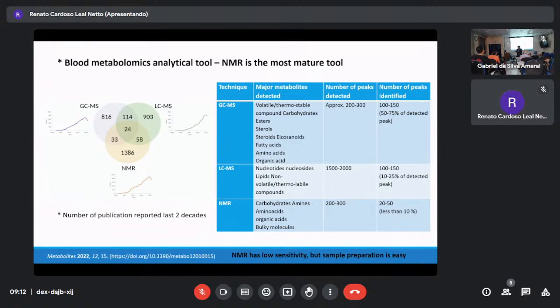They are really small molecules, where the maximum is glucose. We don't have starch except in your feces. So amino acids, organic acids, or sugars, even though they need derivatization, it's still very nice. And what is one of the advantages of GCMS compared to LCMS?